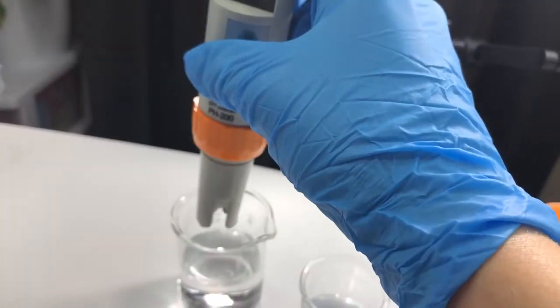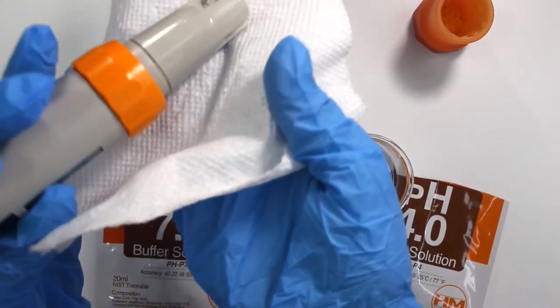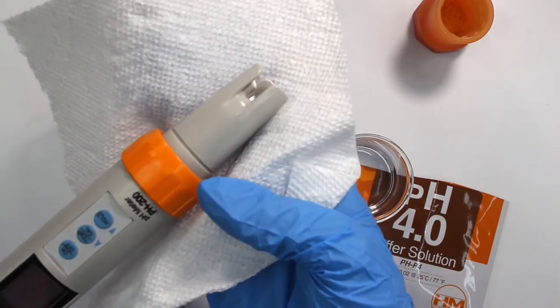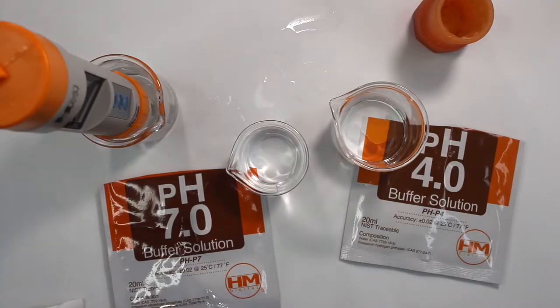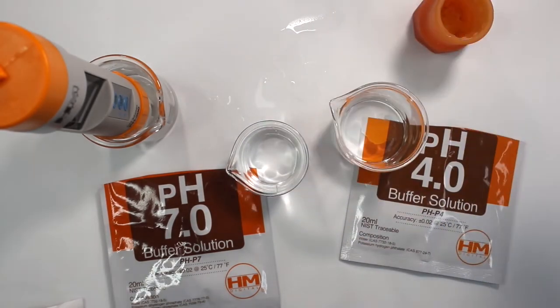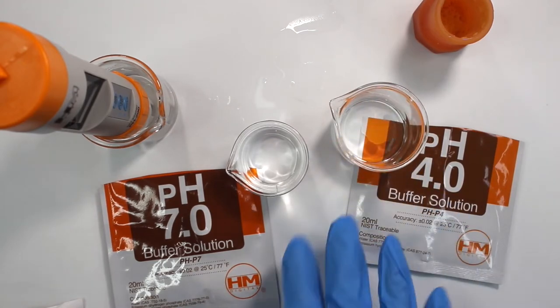Then dip it back into your distilled water to rinse it off and gently dab it with a paper towel. Make sure you're not touching the glass electrode bulb because you do not want to scratch it. Store it back in its cap and make sure it's always stored upright between each use. You want to recalibrate this once a month, unless you aren't using it very often, in which case recalibrate it every time you go to use it.